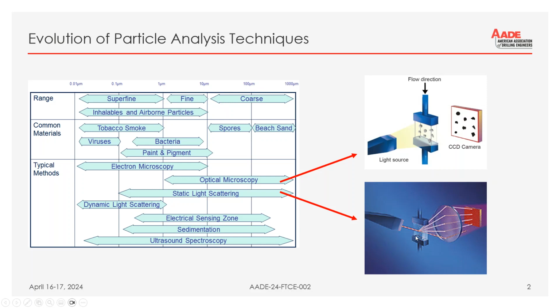This is an indirect measurement technique. You're not necessarily measuring the size of the particle; you're measuring the angle of diffraction. Mathematics are put in, and then you come up with a particle size. All the particle sizes rendered from laser diffraction will assume the particle is round. That's the case for all types of indirect measurement techniques.